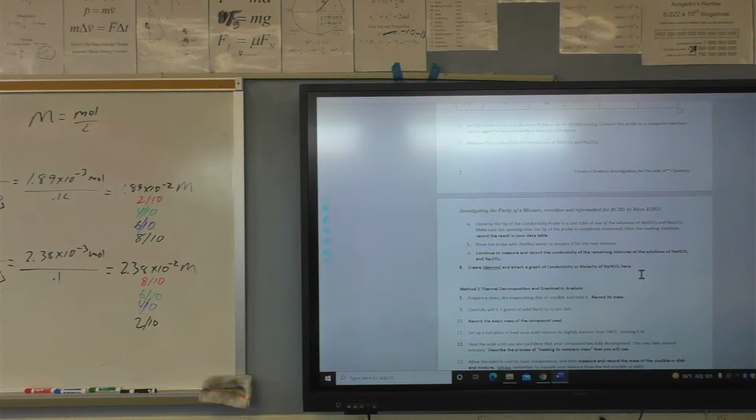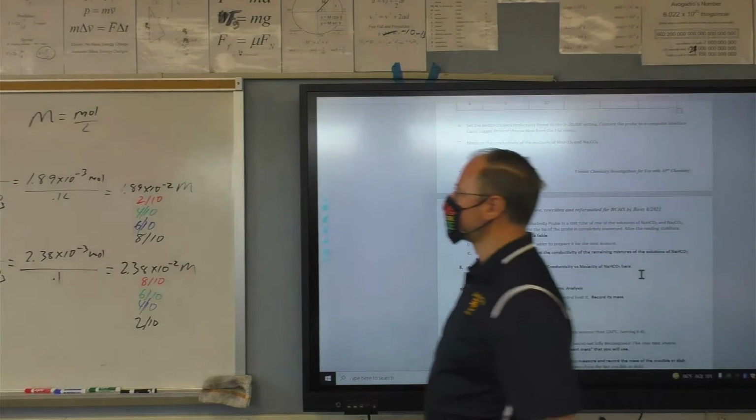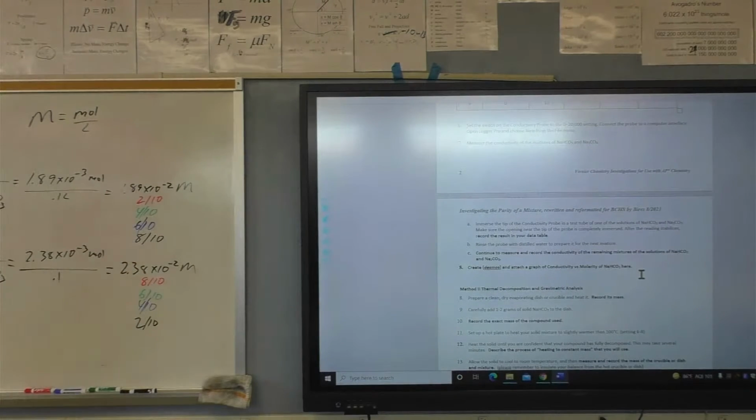It is exactly what we would expect: more conductivity with more ions. If we want it to be exactly proportional, exactly 2/3 or exactly 3/2, we would have to calibrate the conductivity tester, but we ain't gonna do that.